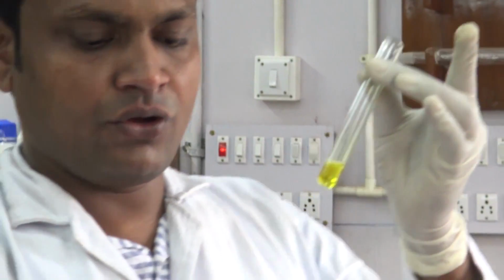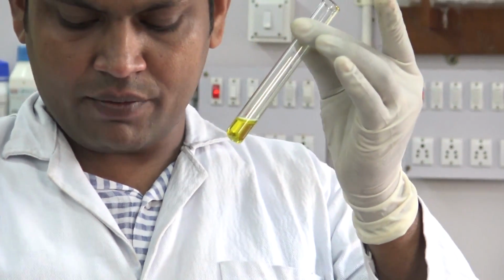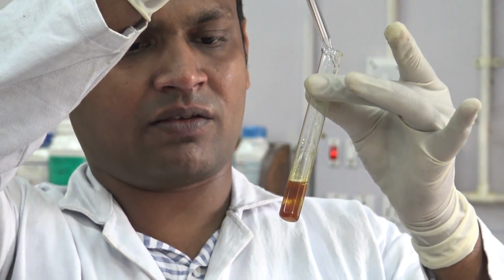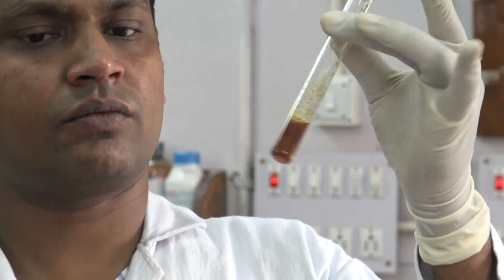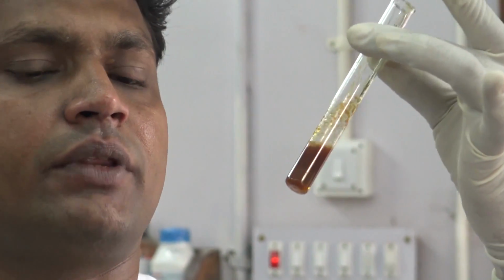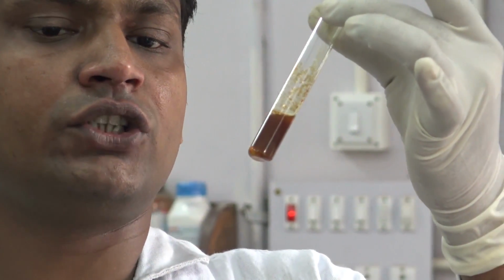Then add a few drops of ammonium hydroxide solution. Here we can see a clear brown precipitate, which indicates the presence of the iron cation.